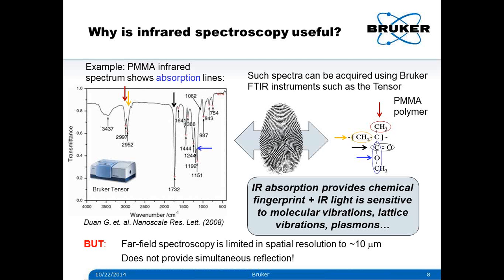The other drawback is that this intensity-based technique doesn't give you the electric field and the phase. The reason for that is that you only measure absorption. You need another independent measurement, like reflection, and this is not provided at the same time in these standard setups.